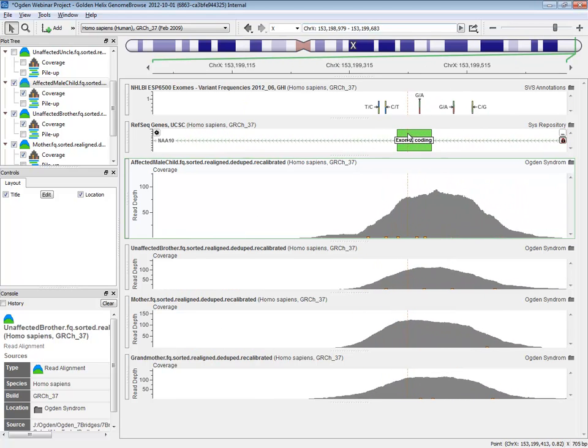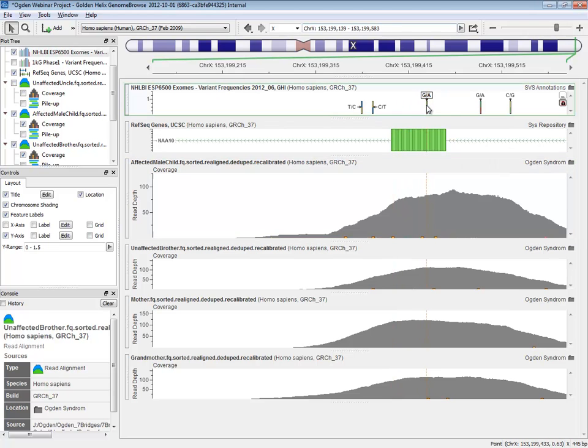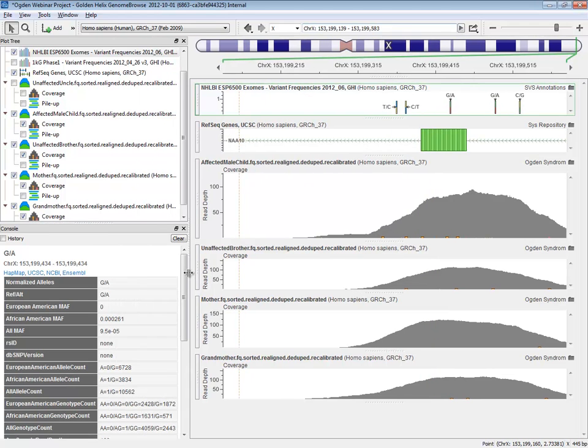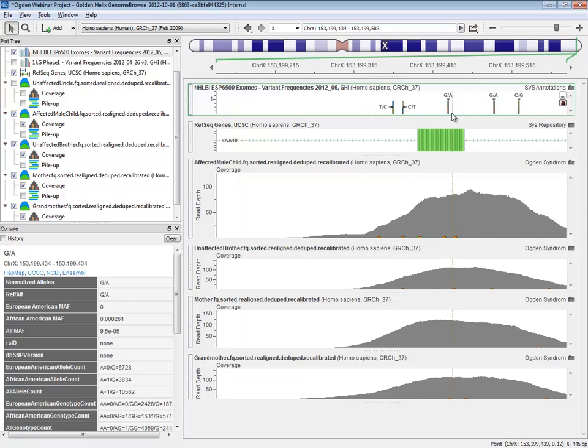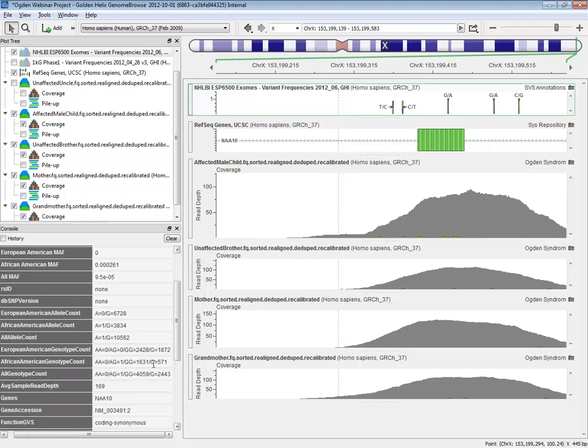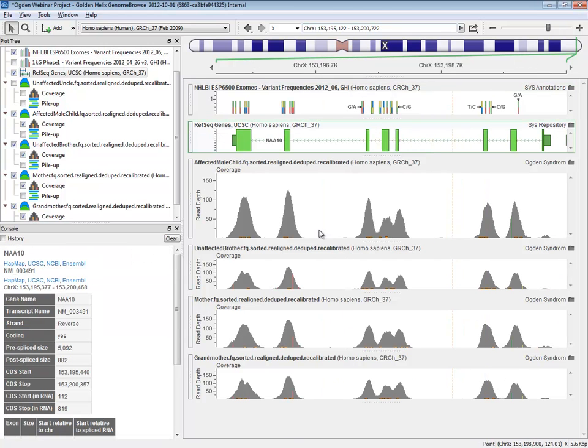We can also look to the fact that there are very few, if any, variants that fall inside of the coding regions of this gene, implying that this gene is pretty highly conserved. In fact, this variant that does fall in the coding region occurs only in an African individual, and there's no hemizygous, so there's no male that actually has this variant, also implying that this gene is extremely important. And indeed, this is the functionally validated result. So there we go. We've used Genome Browse to get to the result we were hoping, and we can be very confident that this is a high quality variant.